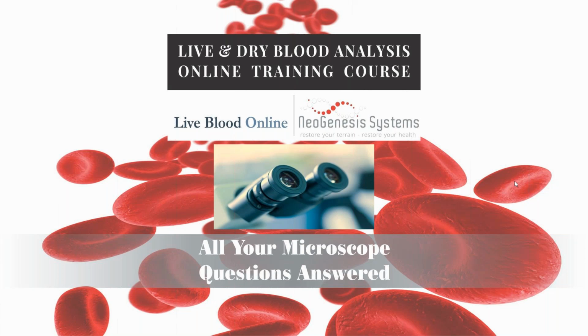Okay, and the other problem, of course, is that a lot of suppliers out there that say they have dark field microscopes for live blood analysis don't actually know the specifications and the intricacies of live blood analysis. It's not that they are deliberately lying, they just actually don't know, do they? Yeah, absolutely. You're quite right. These are usually just microscope companies that supply laboratory microscopes and various microscopes for the microscope industry, and they're not aware of the actual specifications that are required for dark field live blood analysis.